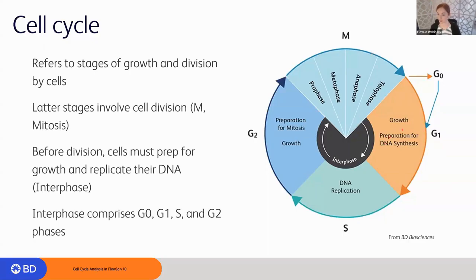So mitosis has been completed, and now for the next stage, we're preparing to enter the S phase, which is where the DNA actively replicates, doubling itself to prepare for the division. And then there's the G2 phase, where DNA synthesis has stopped and the cells are expanding, preparing to enter the cell division portion of the cell cycle.